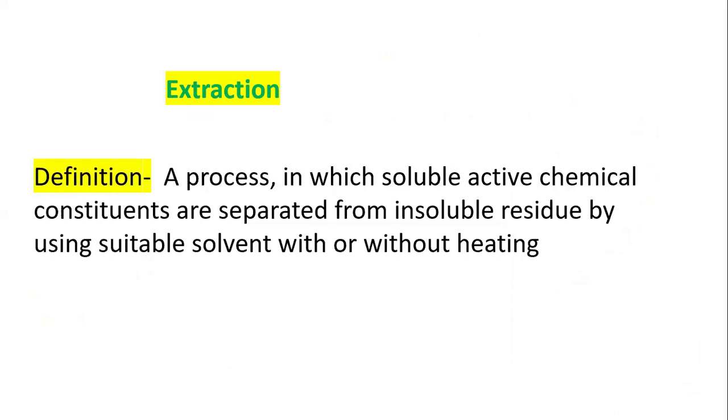In detail, what are its types? How is the extraction process carried out? What is the mechanism of extraction? How many types of extractions are there? What are the different methods? In detail, we are going to see step by step. So, firstly, we are going to see what is extraction.